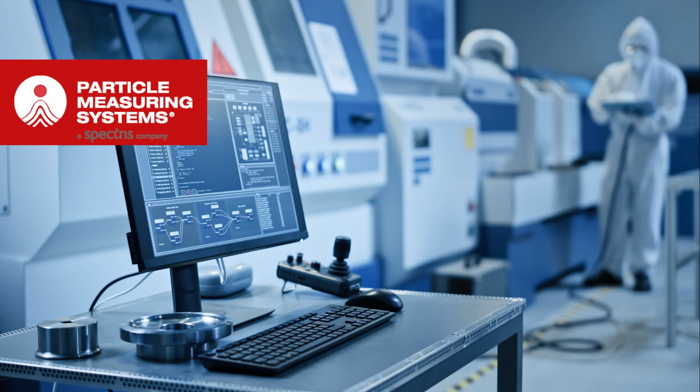So doors are a necessary evil, if you will, and therefore, what are the risks associated with transiting that doorway? And the data will let you know whether or not excessive contamination came through that doorway, or if the doorway was working perfectly. Back in the old days, we used to see a lot of sample points mounted right next to the door. That's where the contamination is coming in. But it's not contamination until it's in the room.